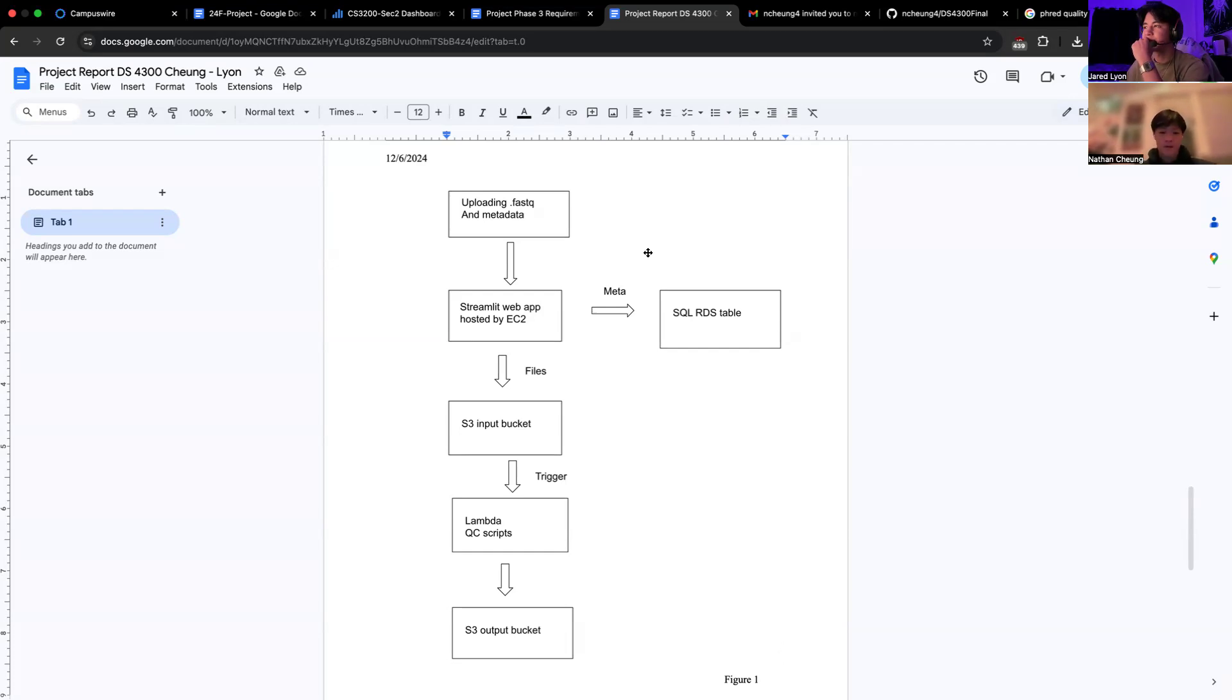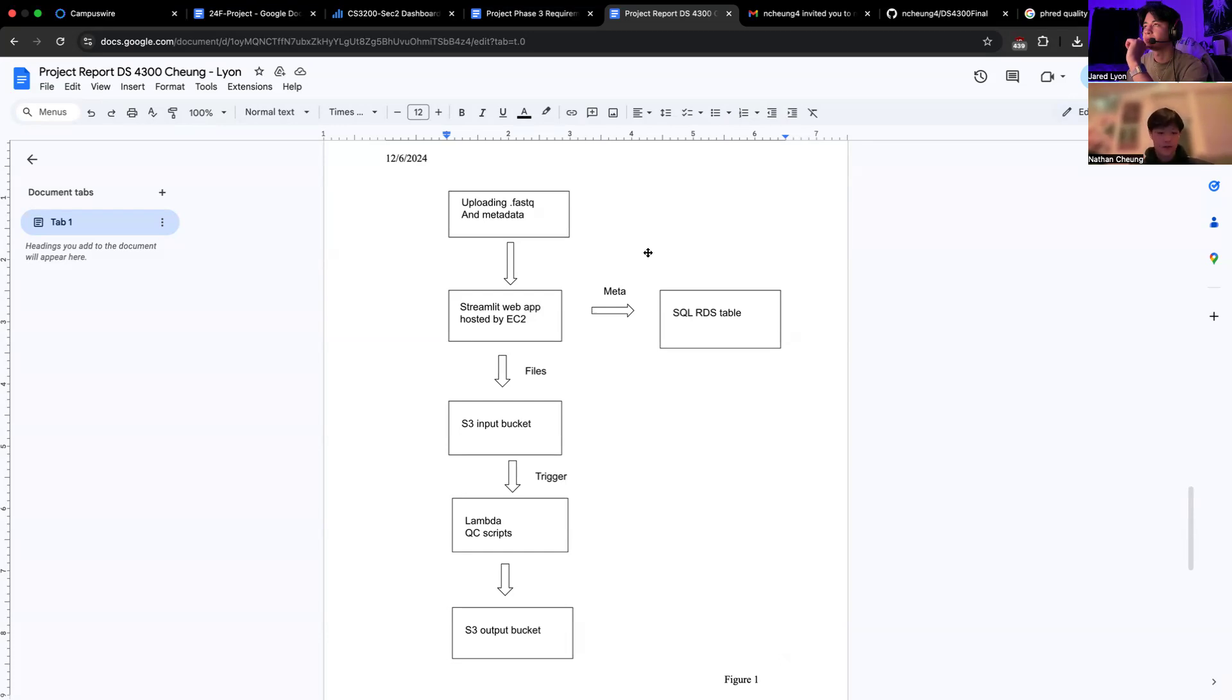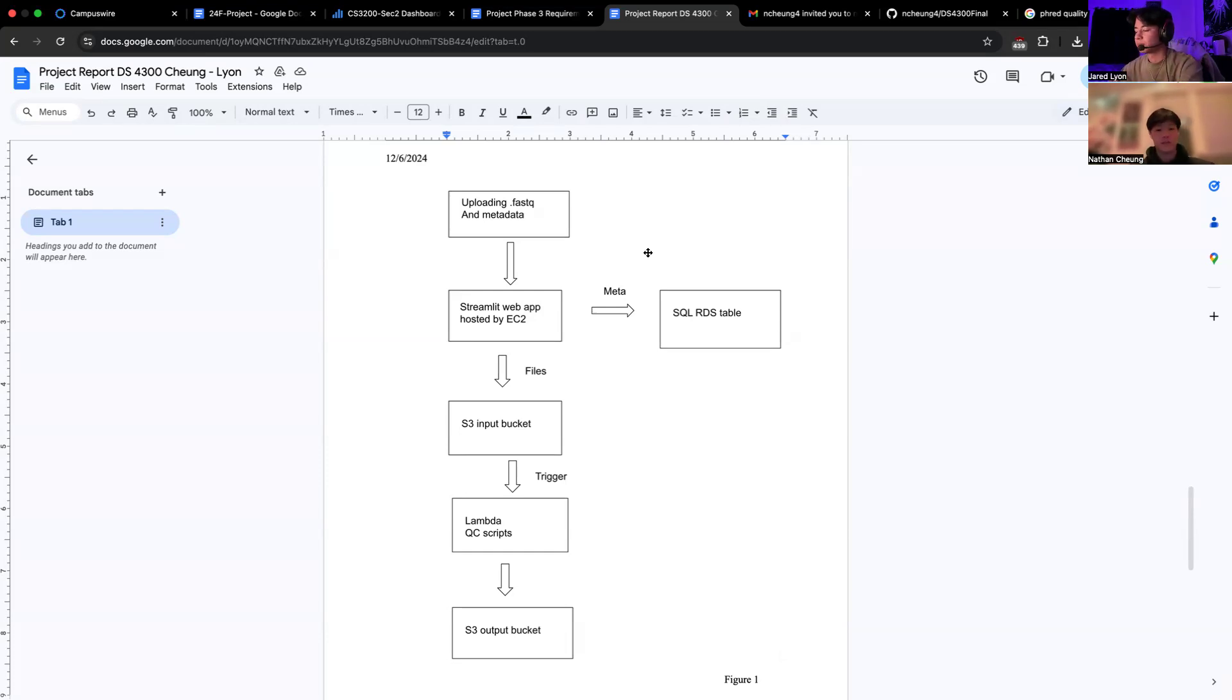Furthermore, we have an AWS Lambda triggering for processing. So whenever a new file is added to this S3 input bucket, this function is triggered and executes a Python script to perform basic quality control and QC on the file.